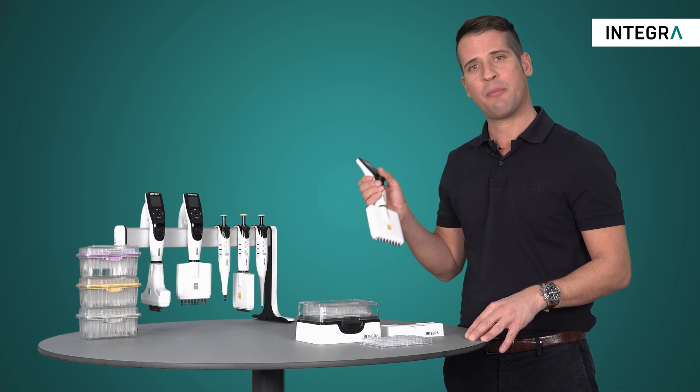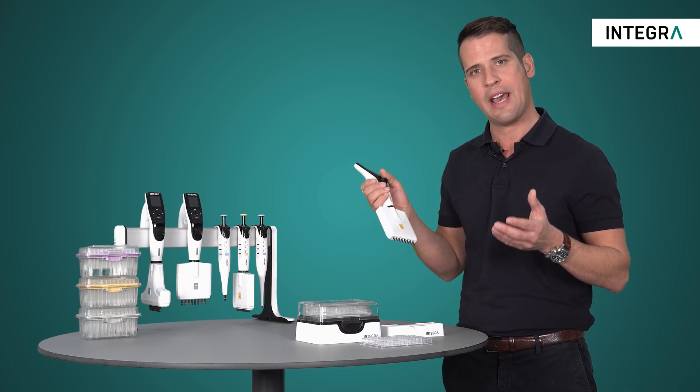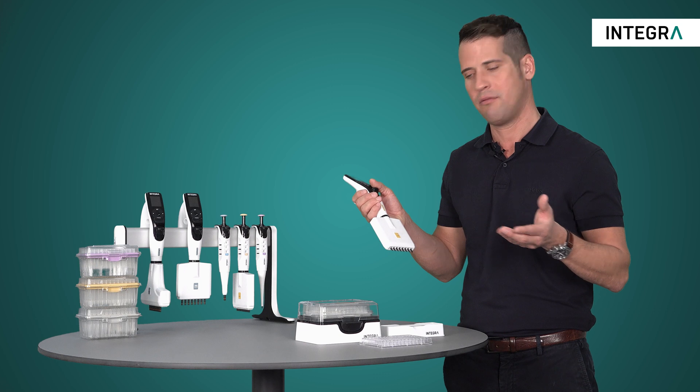With the Integra electronic pipettes, the pipette mix mode is perfect for when mixing is required immediately after the transfer of one liquid into another.